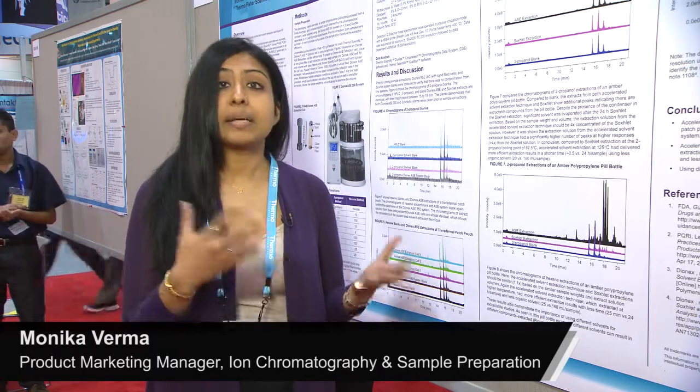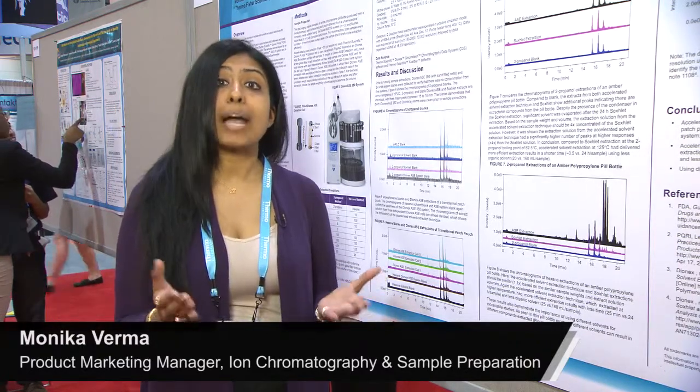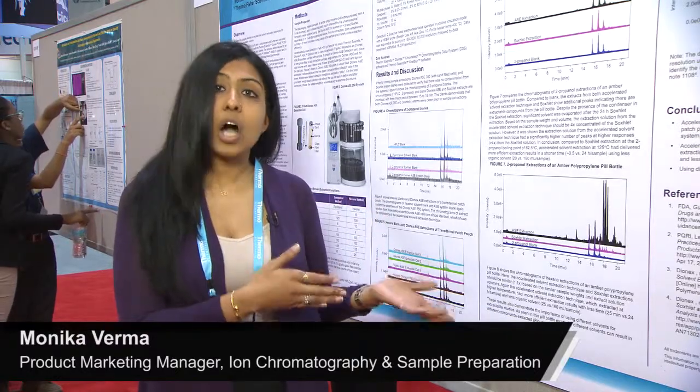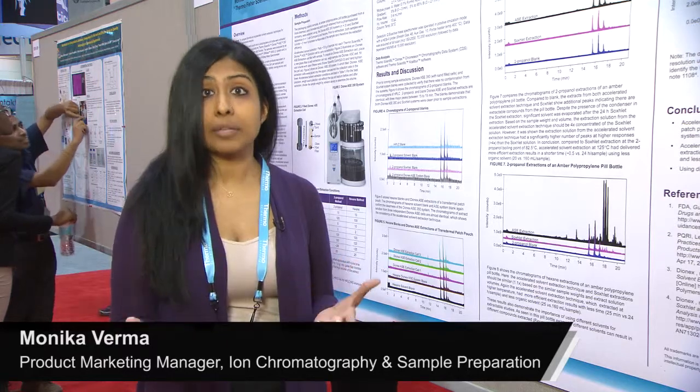The US FDA and the European Medicines Agency have started to regulate and ask for extractable and leachable information to be provided for medical devices and container closure systems. Leachables are basically components that can migrate off of packaging material, and there is a safety concern around it. By analyzing the amount of extraction for compounds, this allows us to know the maximum amount of material that can be leached. Traditional techniques using Soxhlet or reflux are very labor intensive and require a lot of solvent.